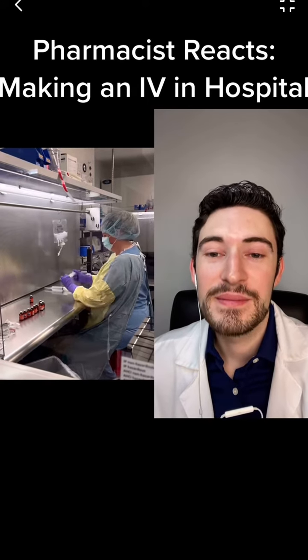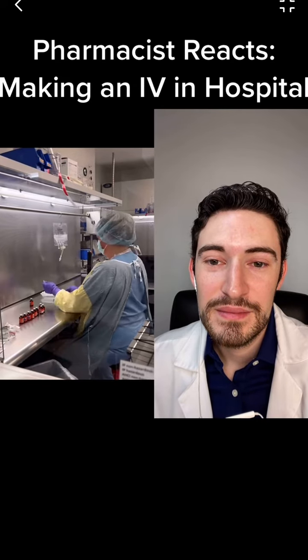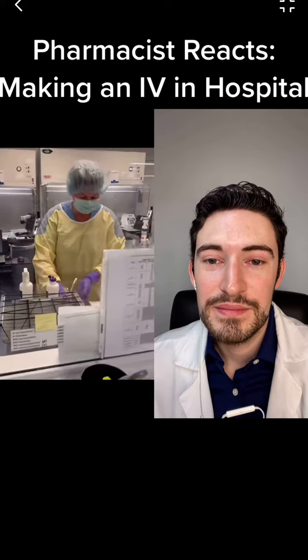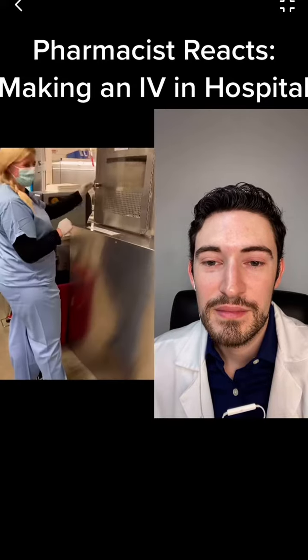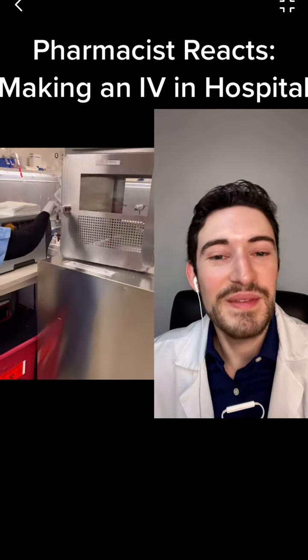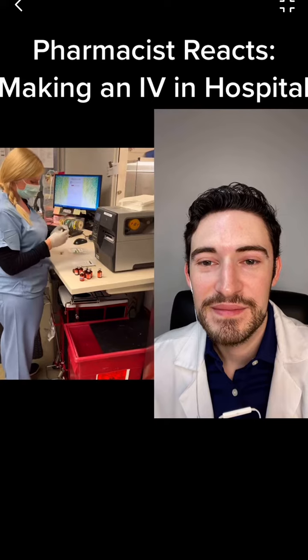After I get all the drug in the bag, I'm going to pull out all of our materials, draw back our syringes, put a little tamper evidence sticker on the end of the IV bag. Very important. Date it with an expiration date and my initials. Okay. That's all going to go to the pharmacist who's going to give it all a look over. There we go. Look at the label, the volume, the drug.